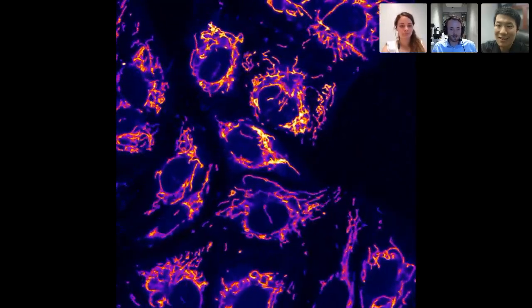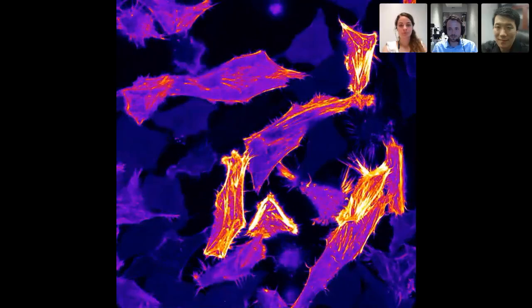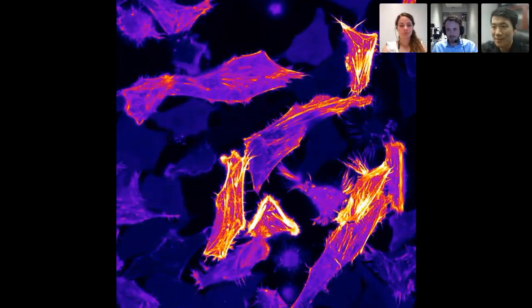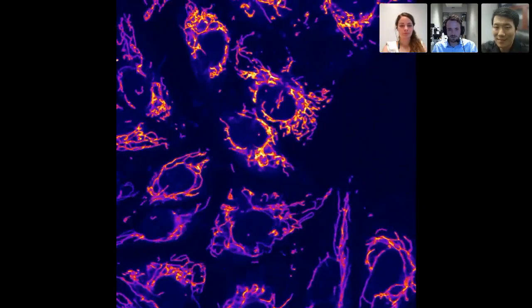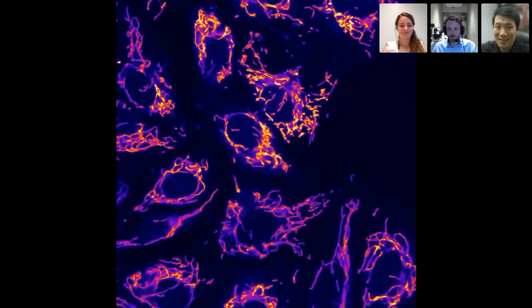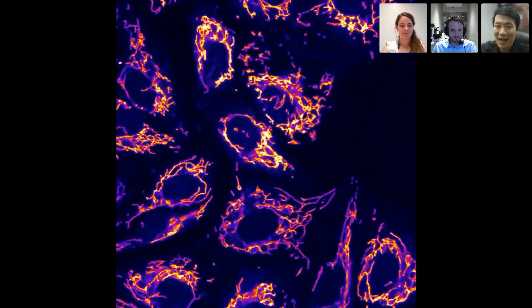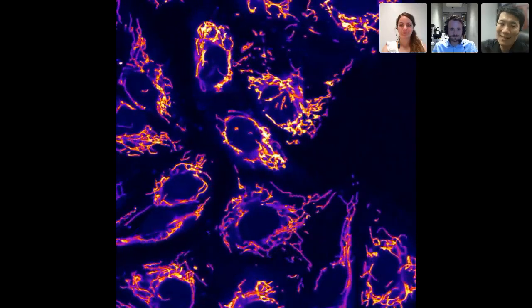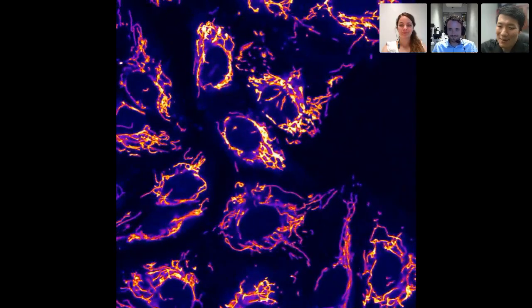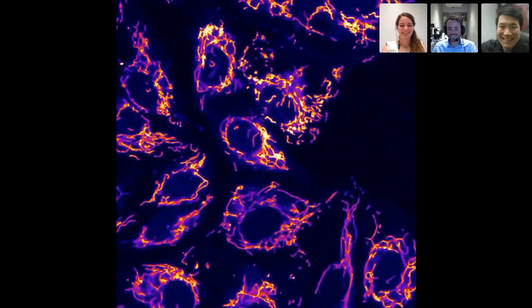Remember the first slide that Dr. Chen showed about laser intensities throughout microscopy? That is really a big difference. So you'll be able to do much longer experiments than what you used to. Actually, I'm not able to see the video in China, but that's fine. Maybe on a positive screen, that would be better.